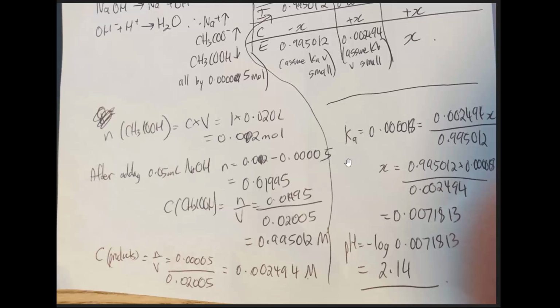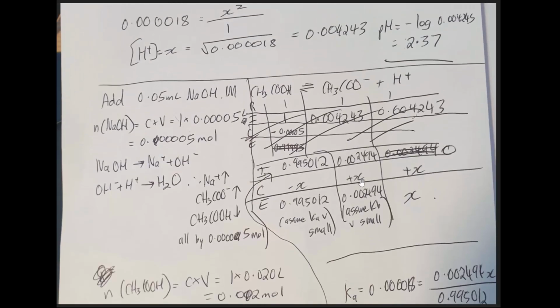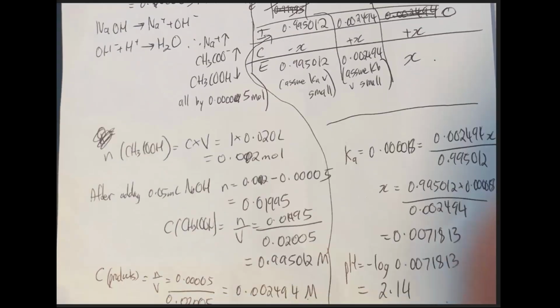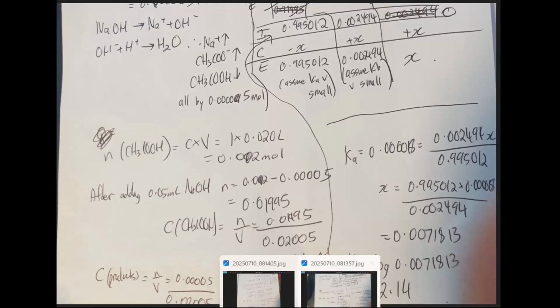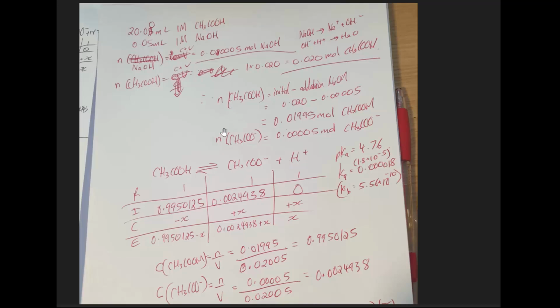And so what I did is I went back and didn't allow the assumptions with the full Rice diagram calculations, not Henderson-Hasselbalch. It uses Henderson-Hasselbalch, by the way, unless you explicitly tell it not to. And it always does the assumptions. And it just tells you the dip is correct as well.